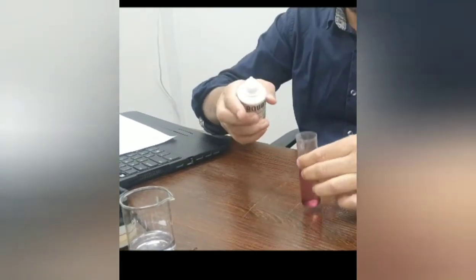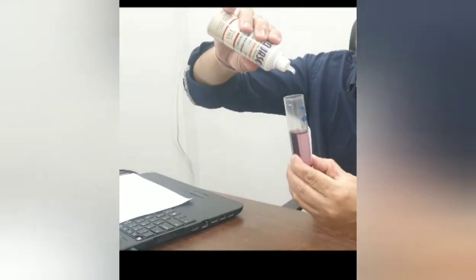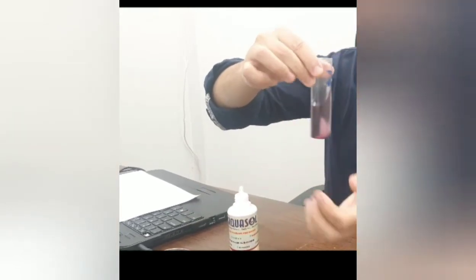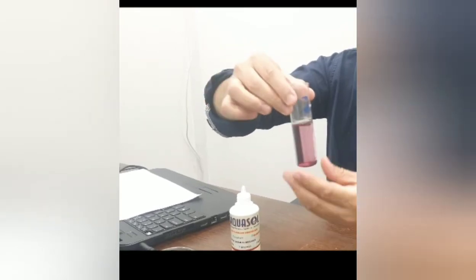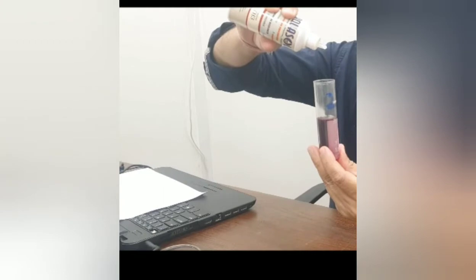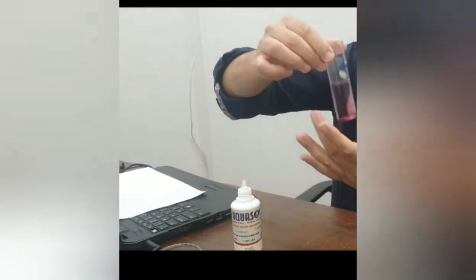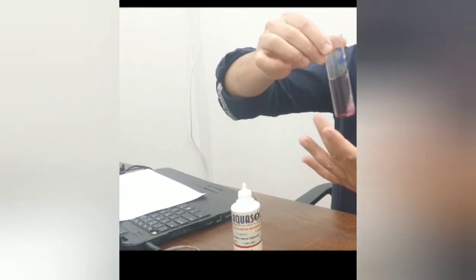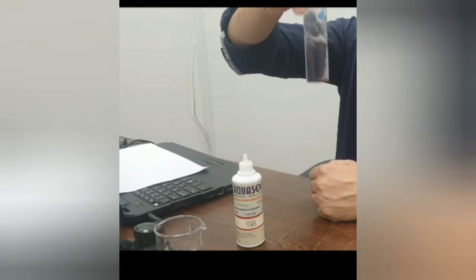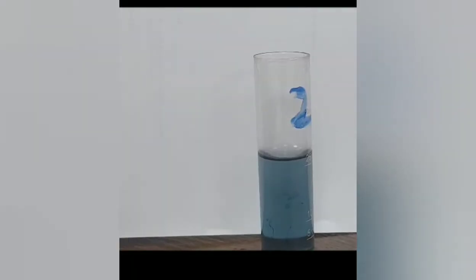One drop of TH3 reagent is equal to 2 ppm of calcium carbonate as hardness. We are counting the drops added to the sample. After addition of 10 to 15 drops, shake the sample to mix. The color is slightly changing. We continue adding more drops because the hardness of this water appears to be high. After 15 to 20 drops total, the color changes from pink to blue. To estimate the quantity of hardness in ppm, multiply the number of drops by 2 ppm.